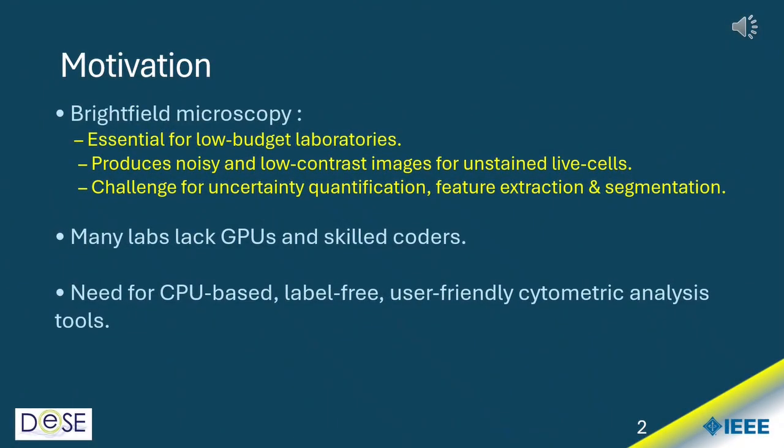The motivation of our work is grounded in the fact that while bright field microscopy is essential for low-budget labs, it produces noisy, low-contrast images of unstained live cells.